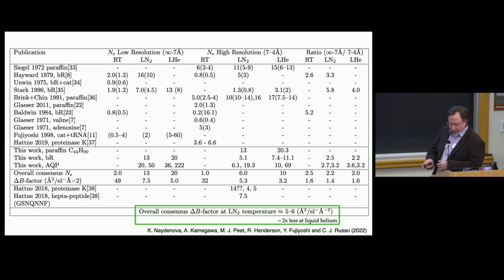And when we started out on this about 7 or 8 years ago, we thought, okay, the people have all abandoned liquid helium microscopes in cryo-EM. And why have they abandoned them? They've abandoned them because when you put your specimen in and you go to helium temperatures versus nitrogen temperatures, the images were always worse at helium temperatures. But if you go back and look at just diffraction work, oftentimes the results were much better. Some of the highest resolution electron diffraction structures like aquaporin and others were all done using liquid helium microscopes.